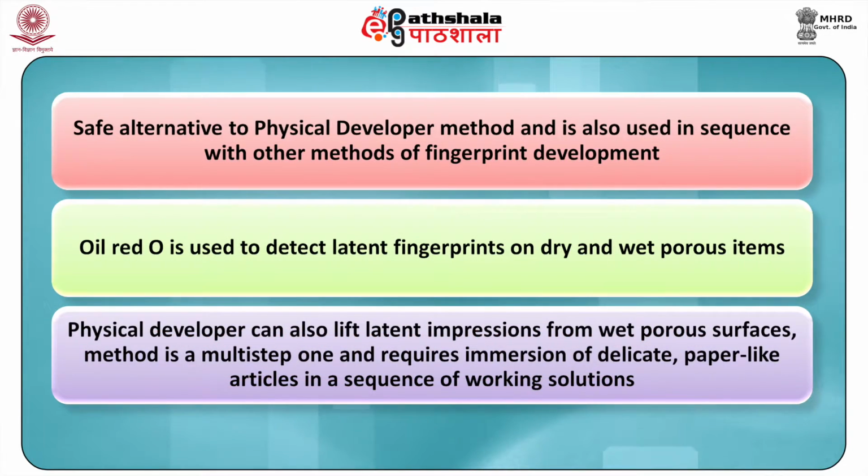It is a safe alternative to the physical developer method and is also used in sequence with other methods of fingerprint development. Oil red O is used to detect latent fingerprints on dry and wet porous items like paper and cardboard.